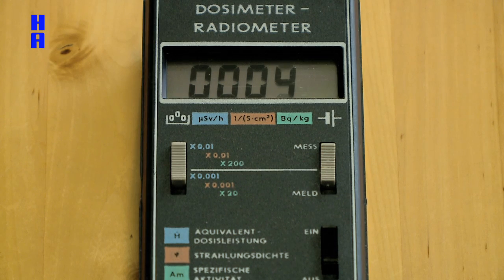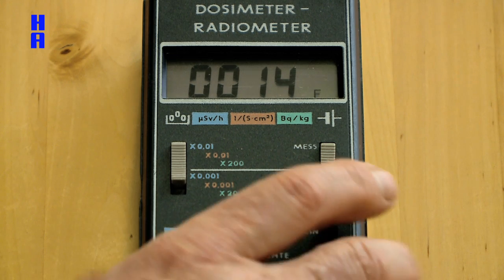The first measurement is an ordinary table which has never been in contact with radioactivity. What we are measuring is the dose rate. This table has a dose rate of 0.14 µSv.